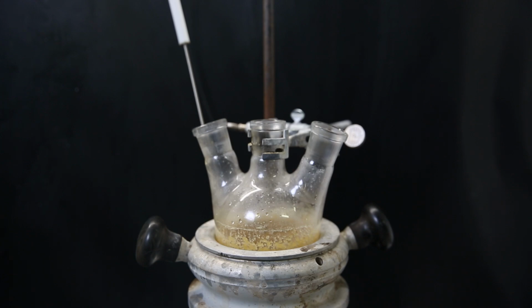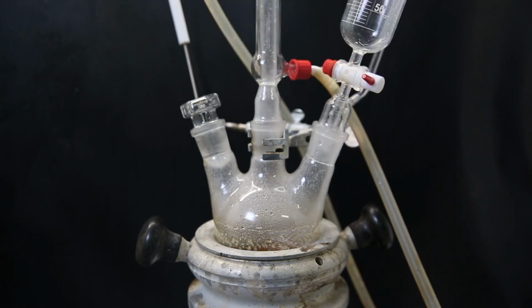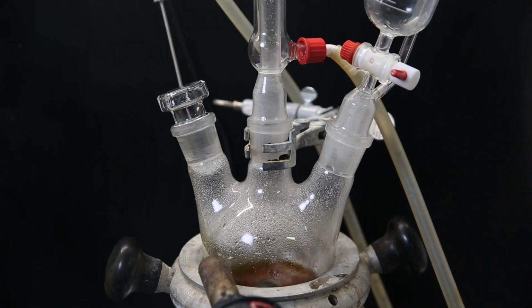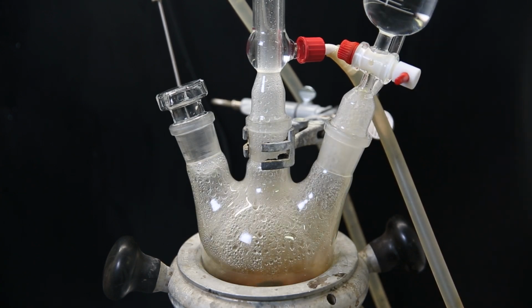So I set the flask in a heating mantle and start heating it to 70 C. I attach a stopper and then a condenser and a dropping funnel. I melt off all of the solid from the sides of the flask with a heat gun. Then to the dropping funnel, I add 90 ml of 60% nitric acid. When it has come to temperature, I add it gradually to the flask and red-brown gas immediately starts evolving from the mixture.